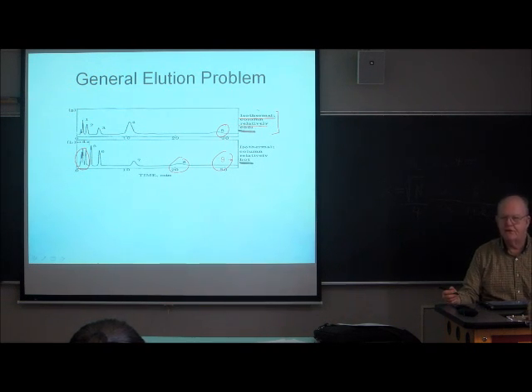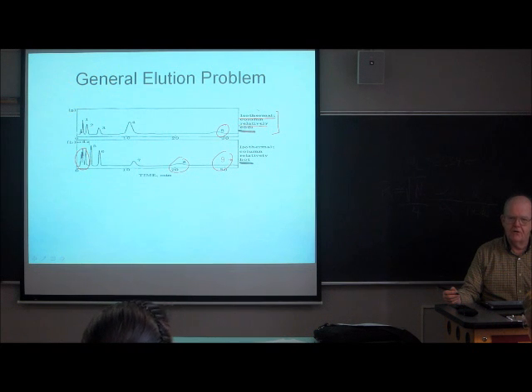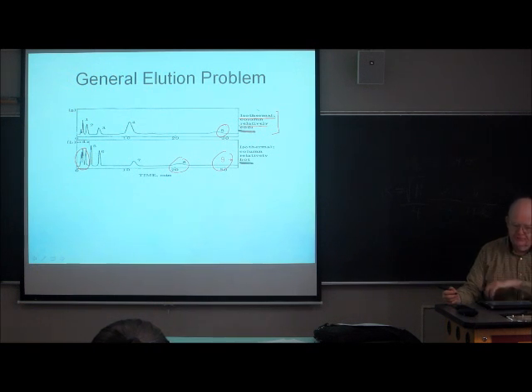Anybody who would buy a GC without a temperature program device on it is wasting their money. But in the early days of GC, you had no choice. It was strictly isothermal. I think it was Varian that introduced the first temperature program gas chromatograph.